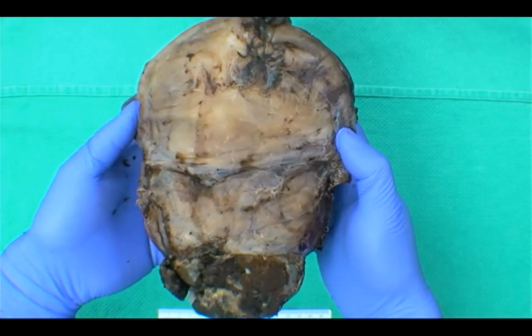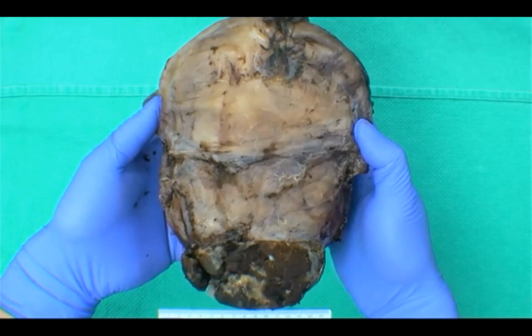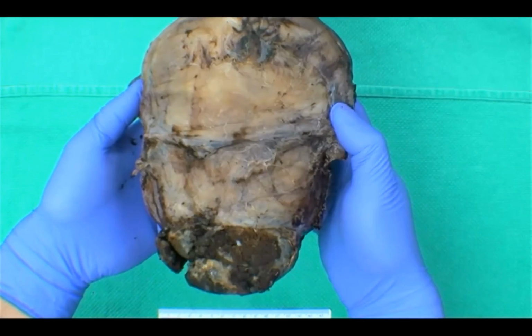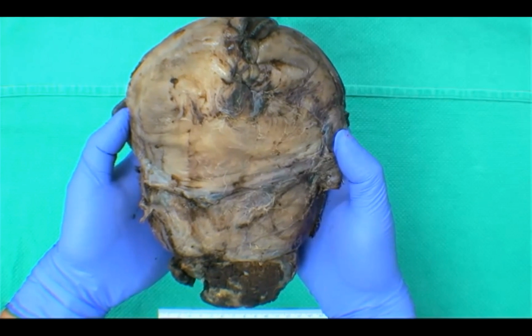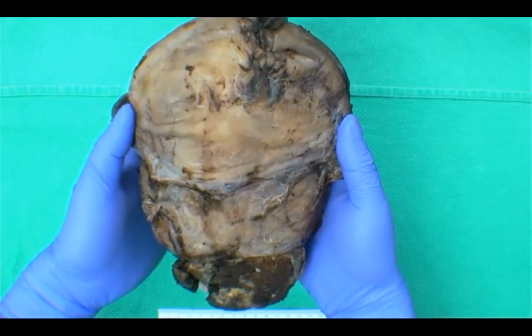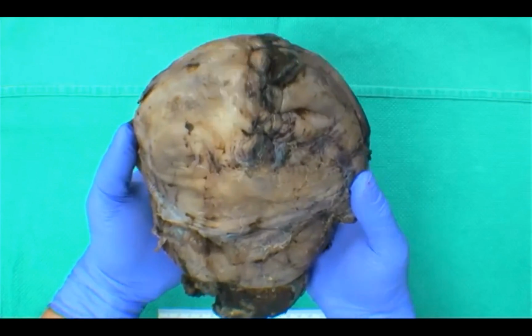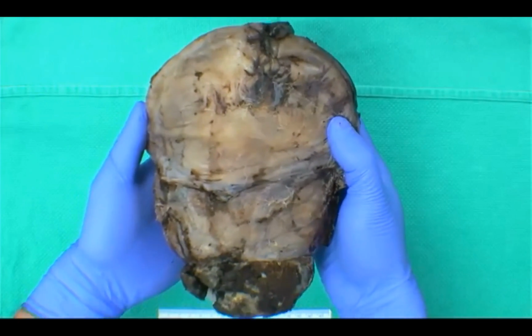Postpartum hemorrhage, especially when it's really bad. And yes, of course, placenta accreta, increta, and percreta, the spectrum of invasive placentas. Very good. Multiple, including cancer is a good one too, but again, probably further down the list. Patient choice, of course, that's always an option. Great. So this is a postpartum hysterectomy taken out for an invasive placenta.